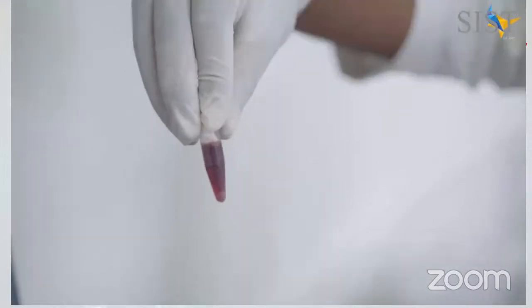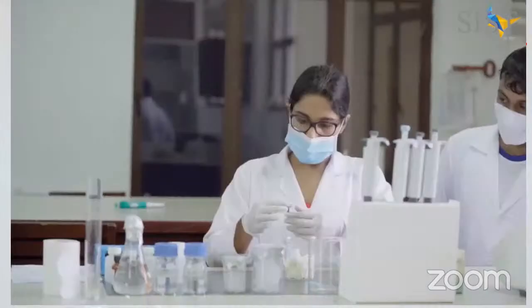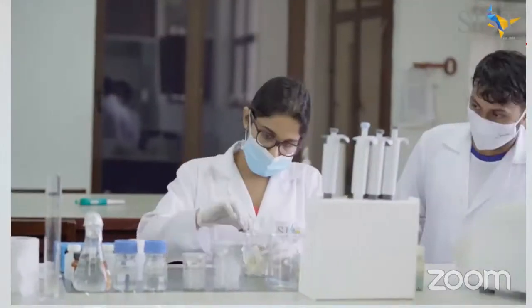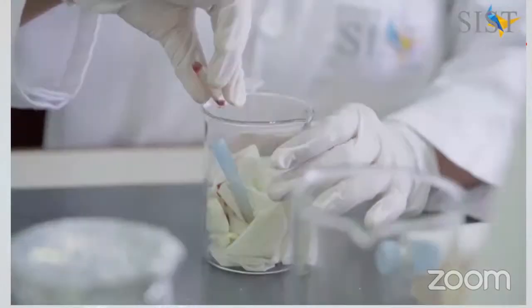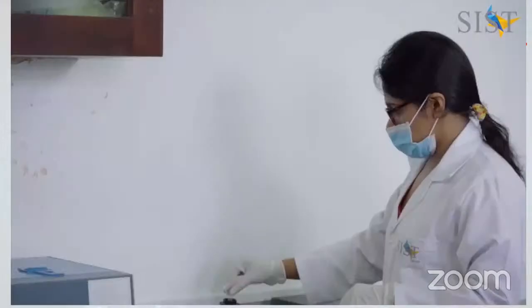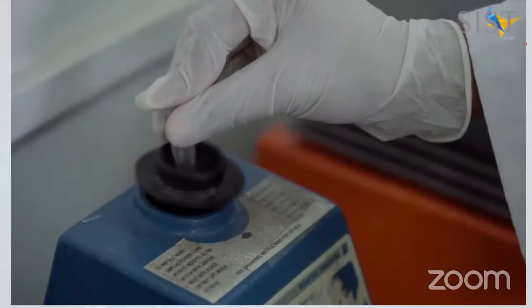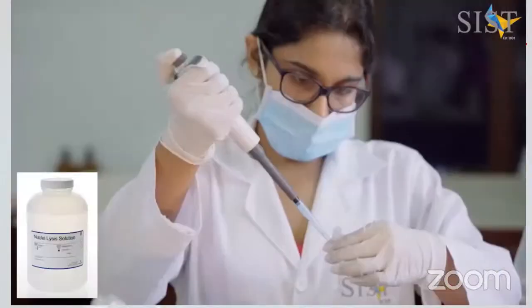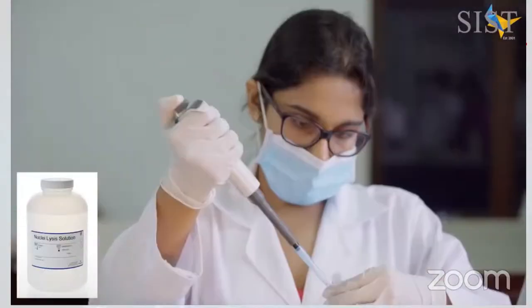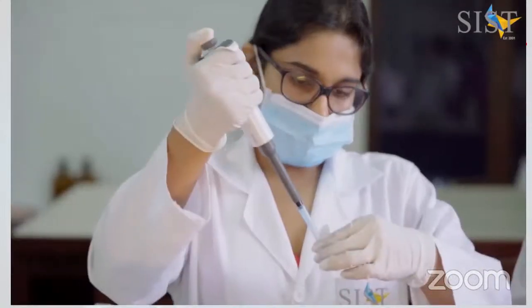When you remove your microcentrifuge tube out of your microcentrifuge, you will see a clear white pellet that results upon centrifugation. You discard the supernatant and obtain the clear white pellet. Then this white pellet is vortexed very vigorously to ensure that the cells are further lysed. To the vortexed content, you will next add the nuclear lysis solution. Once the nuclear lysis solution is added, you have to gently pipette mix the contents to ensure proper lysis.